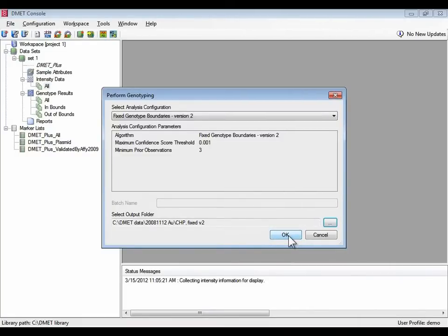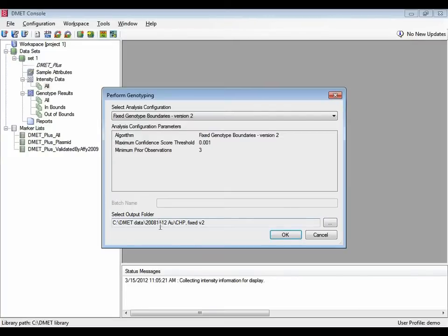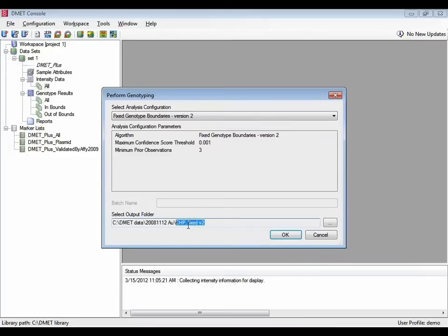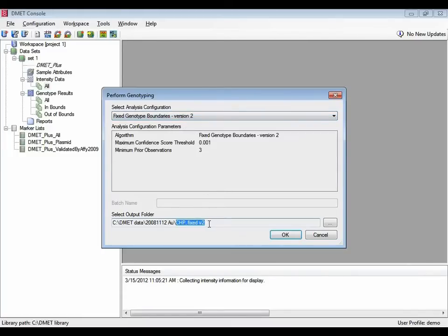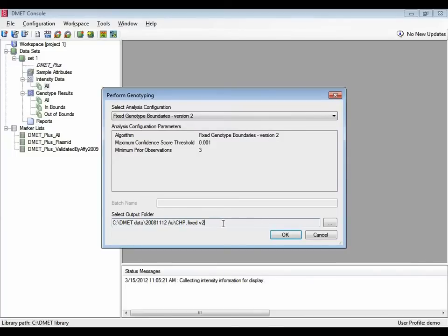Now that you've selected your genotyping method, you should also verify that the output folder is what you want it to be. It will default to the last place that you saved it. In this case, I saved my initial results to a folder that I named chip files fixed v2 as a shorthand for saying I'm saving my genotype results in the fixed version 2, fixed genotype boundaries version 2 method. I prefer to add the analysis method to the name of the folder where I save the chip files in case I want to compare different versions of the results. Once you've selected that, then hit OK.